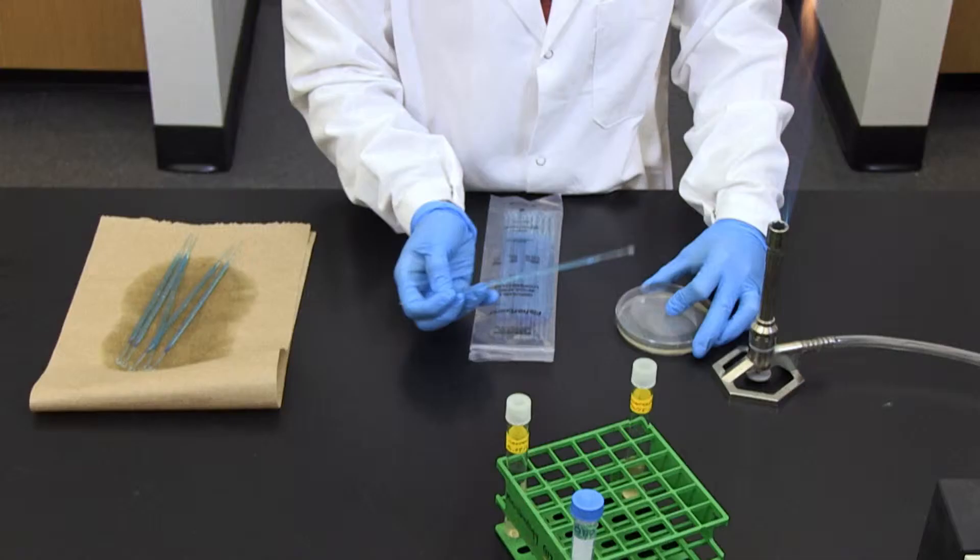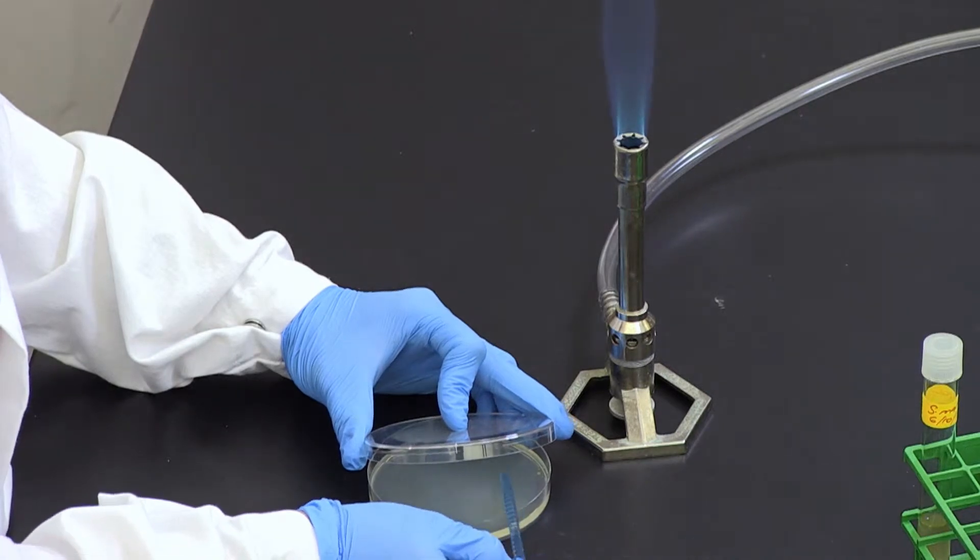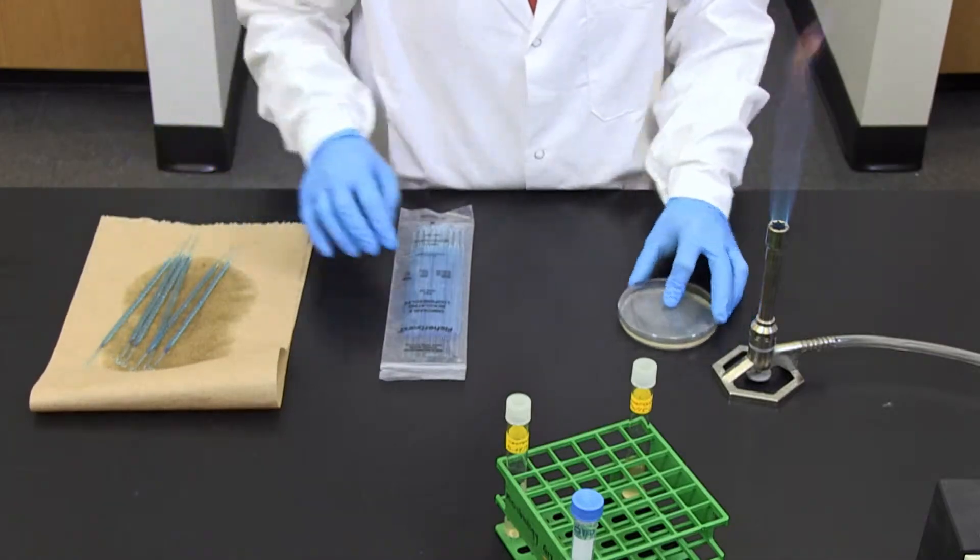Quadrant Streak. First, streak the inoculating loop full of microbes in a small area near the edge of the plate in area 1. Apply lightly to avoid gouging into the medium.